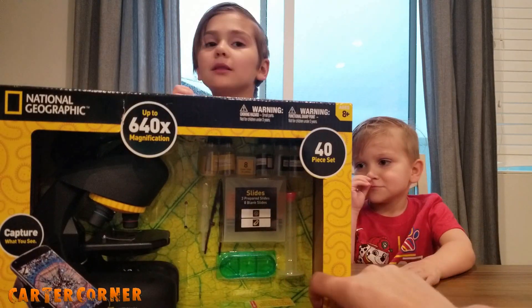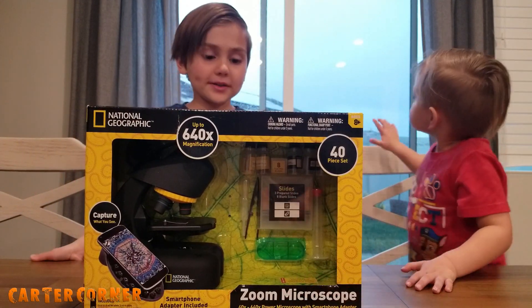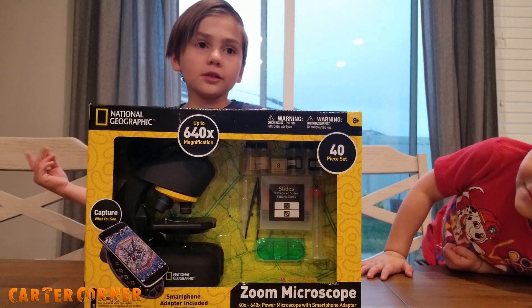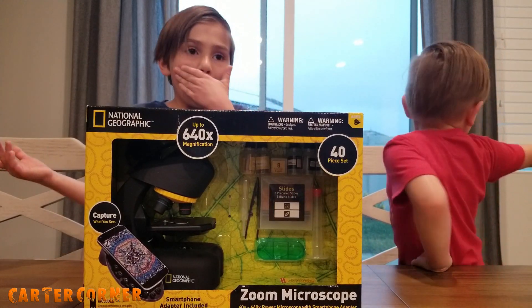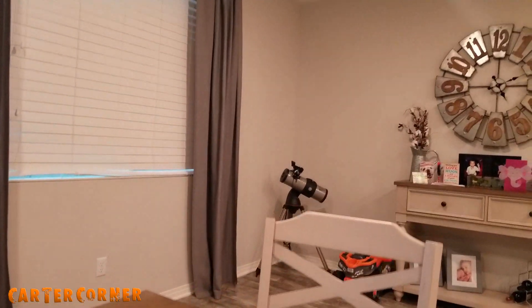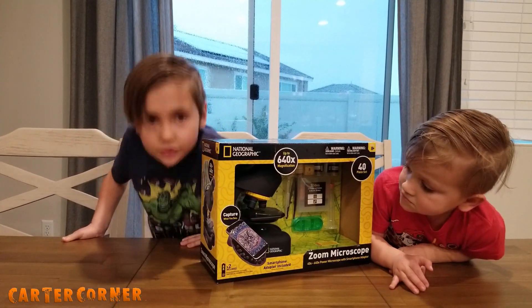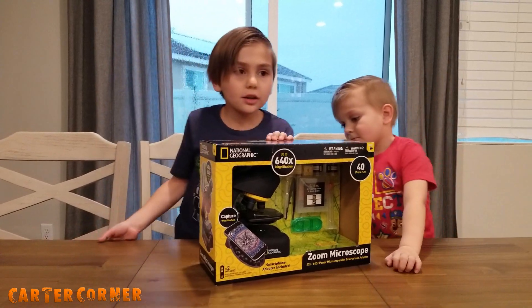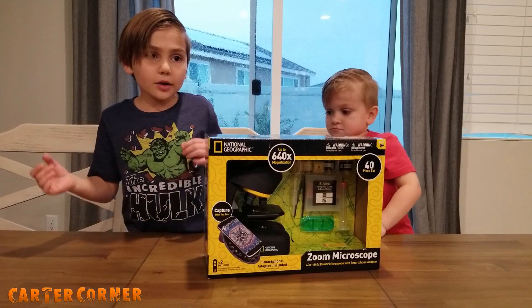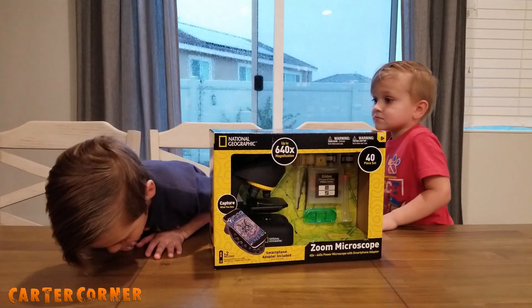So I could like, see the moon and stars with this? That would be if it was a telescope. So what's a microscope then? A microscope is something to look at objects when they're right here, but you can look even closer at them — instead of having to zoom in from far away.